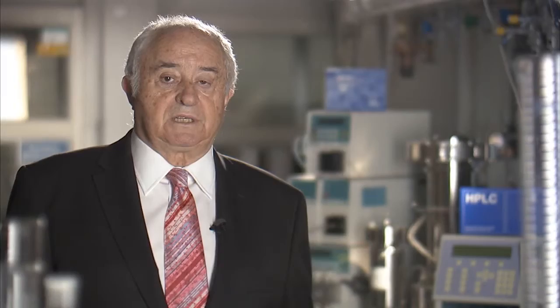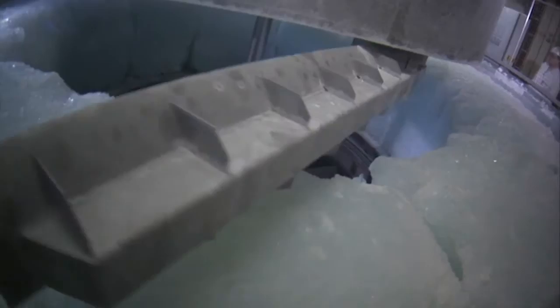Merck is the world's largest producer of silica for chromatography, turning out more than 1,000 metric tons per year.